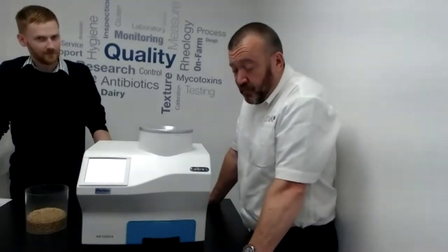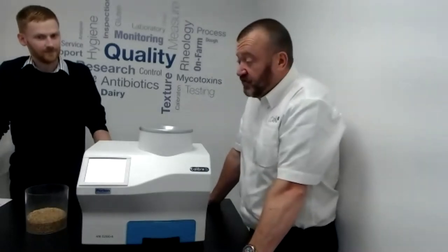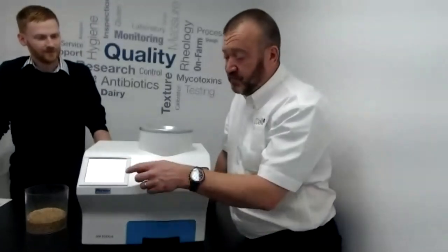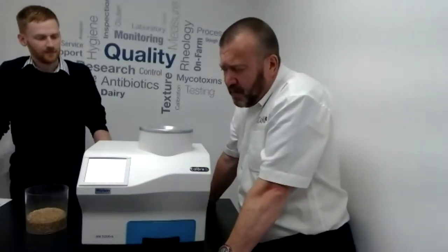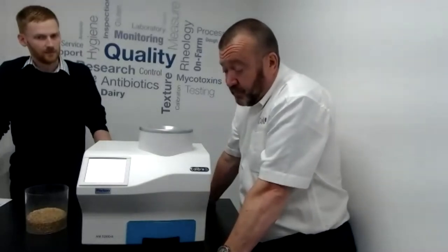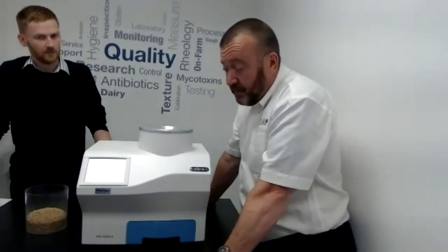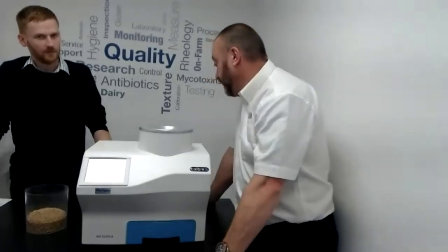As Joel mentioned, we can also create duplicate channels — you can have as many wheat or barley calibrations as you wish, all with different biases. We can't quite show the screen with this camera setup, but there is a video that explains it. The menu is quite straightforward — you log in as a user with a provided password, then adjust the biases of the moisture and specific weight to fine-tune for your particular stores or laboratories.